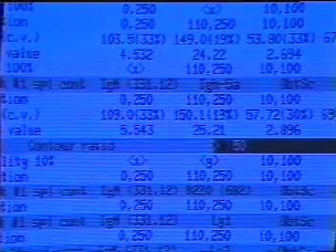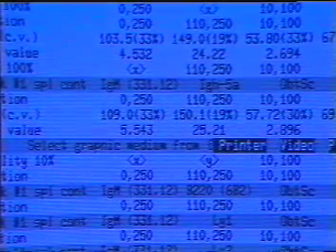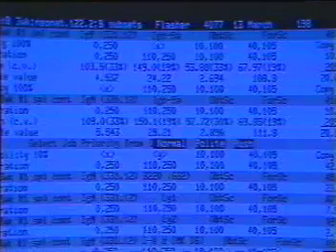By pressing Tab again, we accept the 50% default and advance to the graphic medium prompt. We select the plotter and again press Tab, thereby advancing to the priority option menu. When we press Tab to accept the normal priority default, the new analysis line appears on the card.